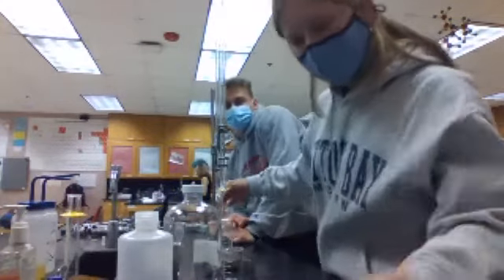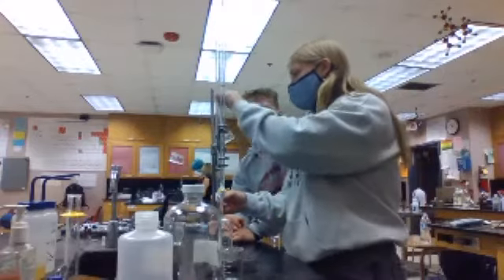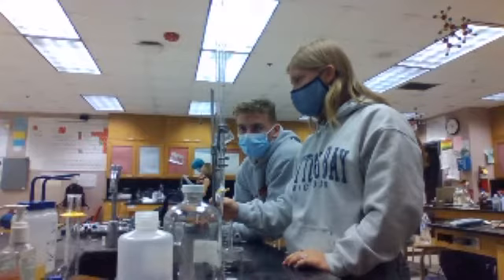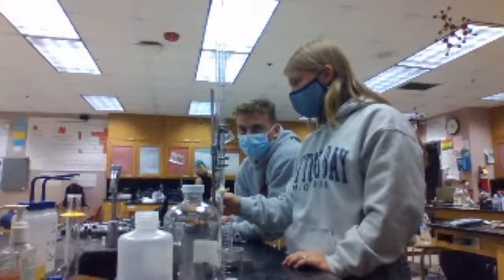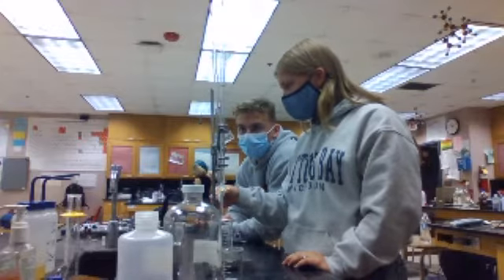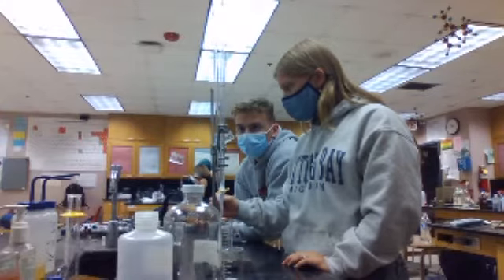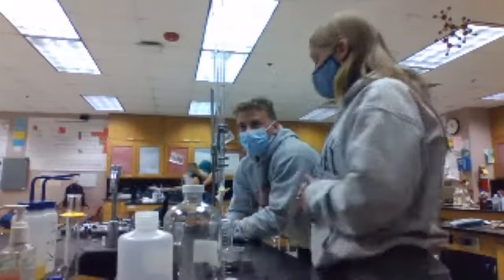So what was the original? Around 30. You put in the formula, you know the molarity of the base, you know the molarity of the acid. Oh, that is the molarity, yeah. It's a strong acid, so the molarity is equal to the hydrogen concentration. Okay, thank you. And you know the volume of the acid is 10. Did you get that? That's right.